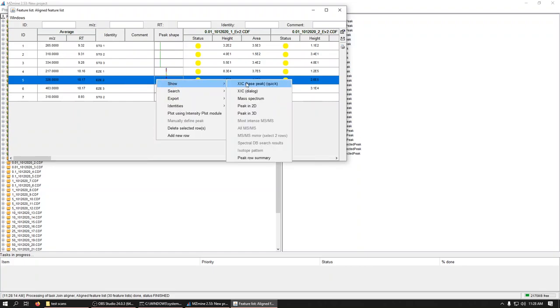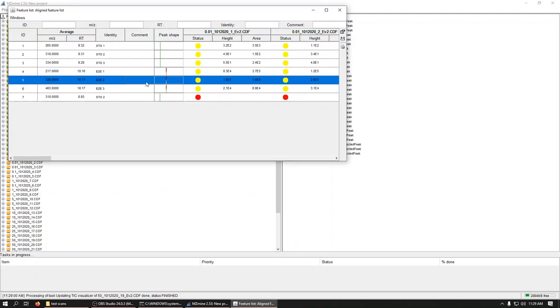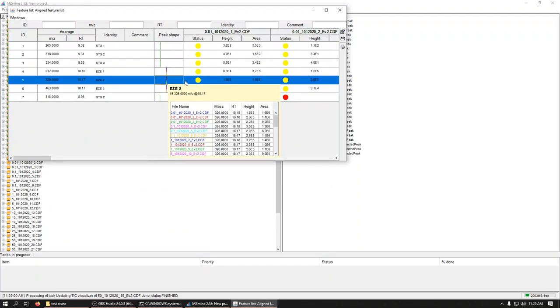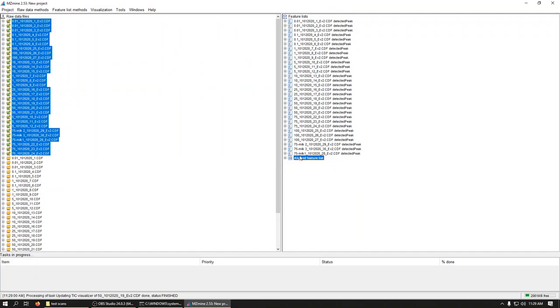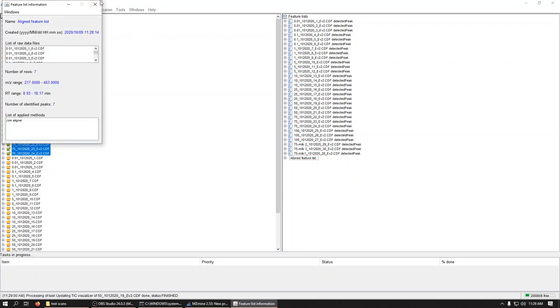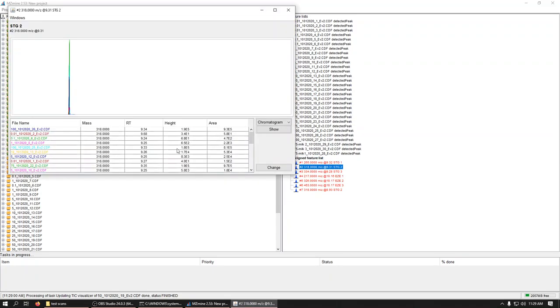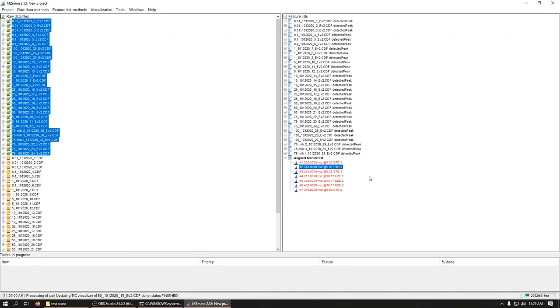And then I'm going to pull up this one because I know that it's the one I wanted to quantify off. So if I do, I can see all of them together. If I pick one of the peaks, I can see all of them lined up on top of each other. Very nice. Yes, we picked all the same peaks. We've got all the areas. Now we want to get this out so we can actually use it.